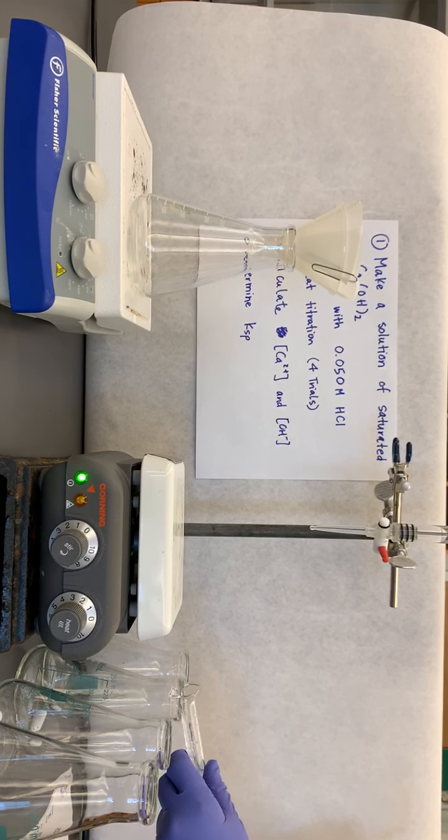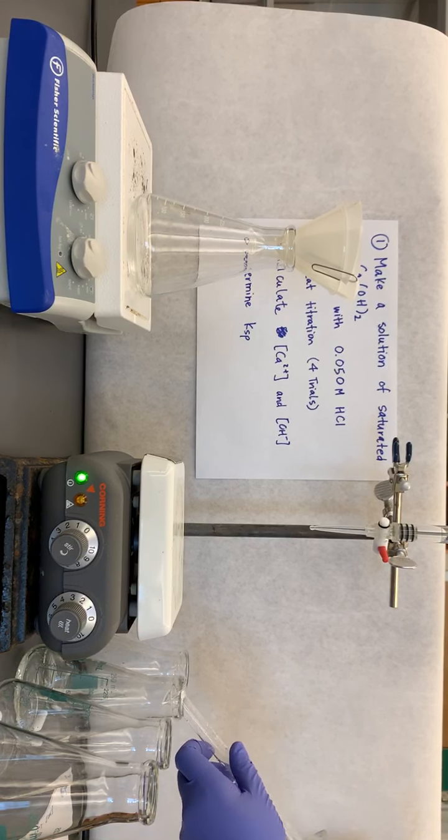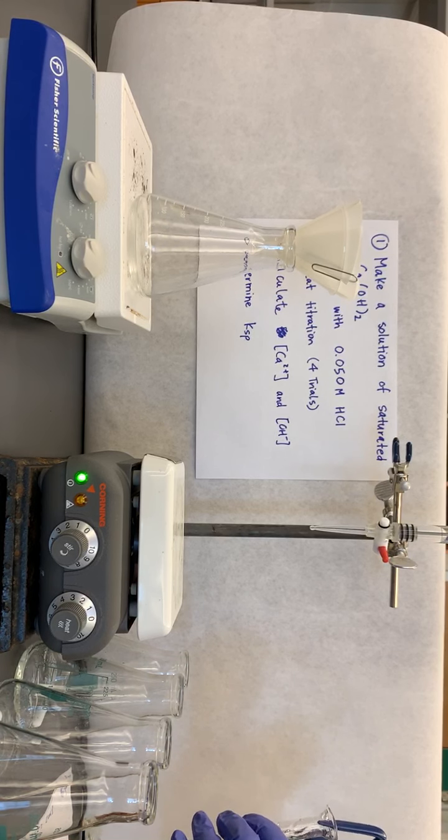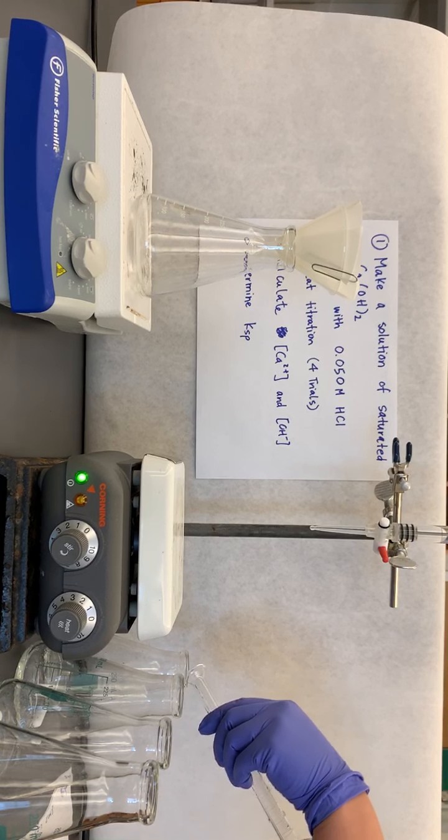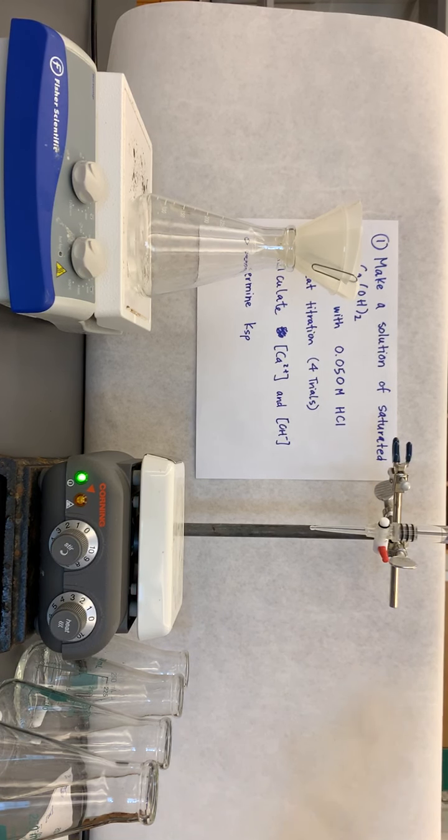Now the amount of water doesn't have to be exact, because really it's just to dilute the calcium hydroxide that I'm going to add to it, so that there is enough liquid in here so I can see the color change. A little more, a little less, doesn't really matter.